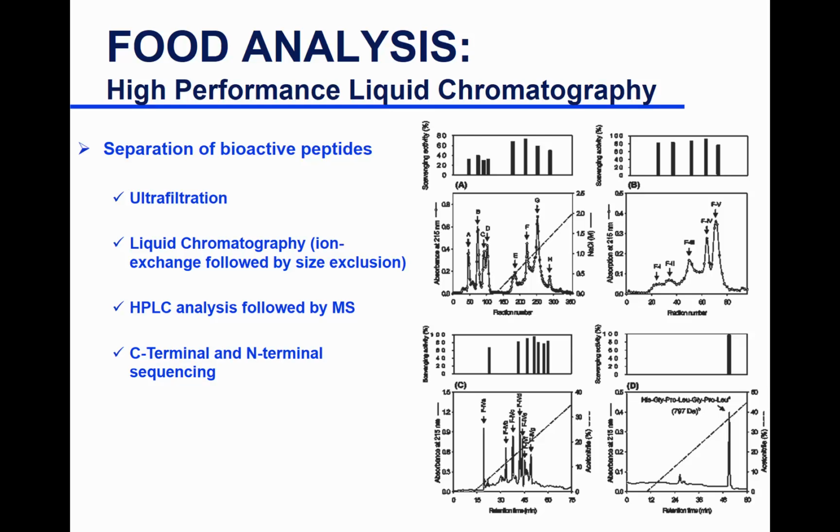It's about what? 2,700? Yeah. So then you want to have a cutoff of, let's say, 3 kilodalton. Everything larger than 3 kilodalton you get rid of, and whatever non-retentate permeate goes through the filter, you collect that, and that would be your first purification step.